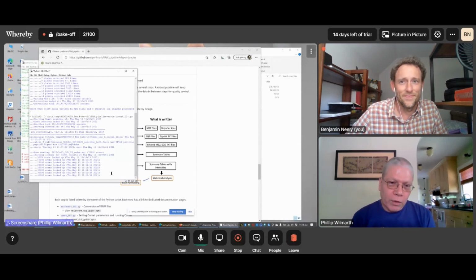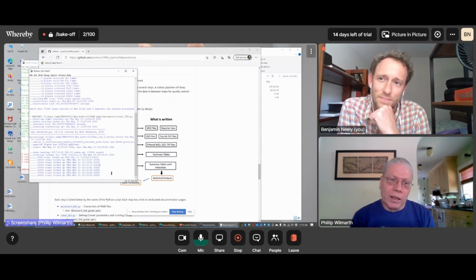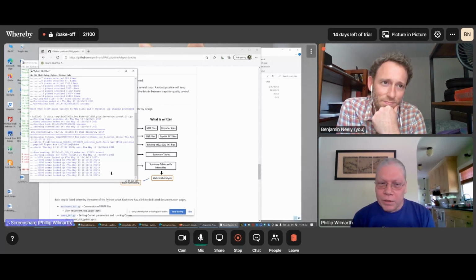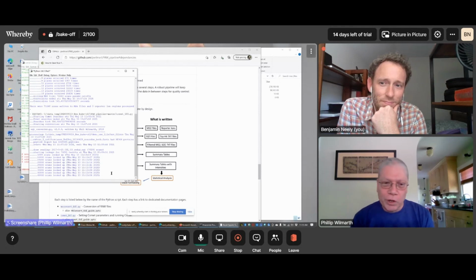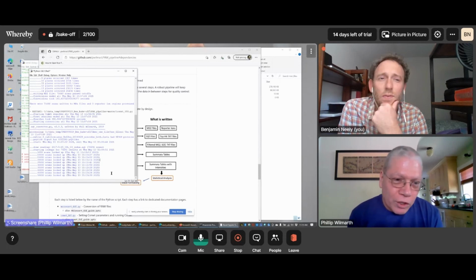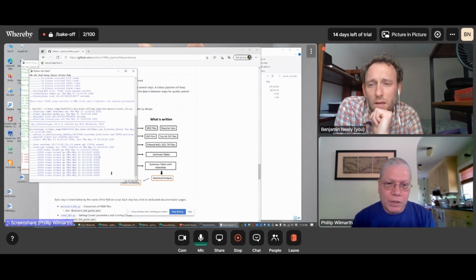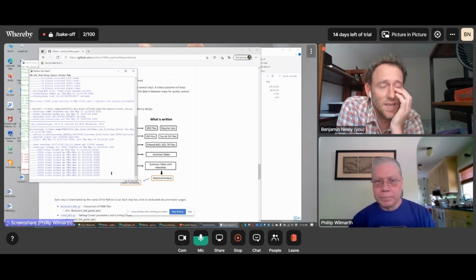The lookup here, there's a lot of time up front to digest the whole FASTA file. And then once that's done, the lookups get progressively faster as there's more and more data that gets searched. It kind of remembers what it's already looked up. And you see the peptides multiple times, typically in experiments. So that kind of speeds things up. So there's a little upfront cost, but then it goes pretty quick once it gets going. And here it's just chugging through the different scans that are there, and we got to get up to 70,000 scans. Wait, will you say that again?